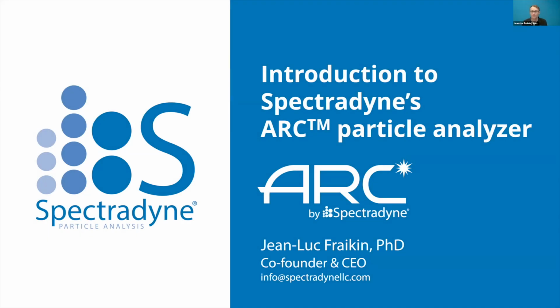All right, hi everybody. Today we're going to talk about Spectradyne's arc particle analyzer and how it can be used in a flow core environment and the value that it brings as an extension of conventional flow cytometry.